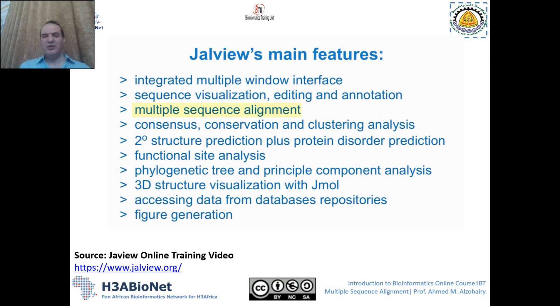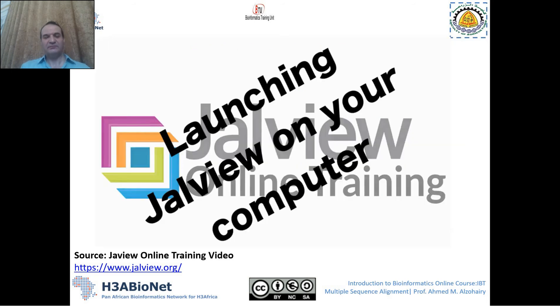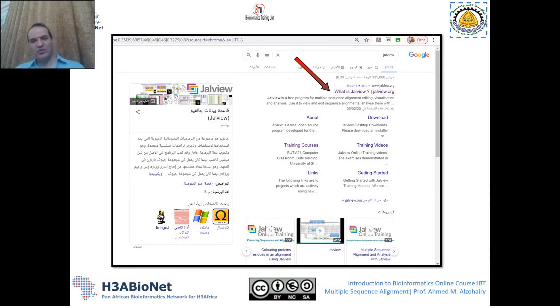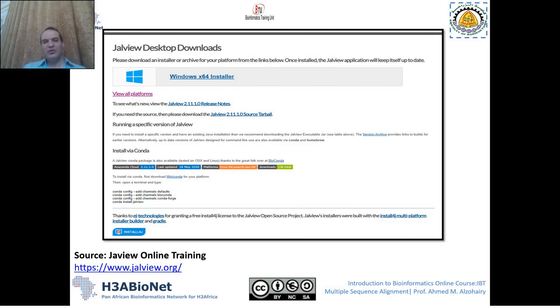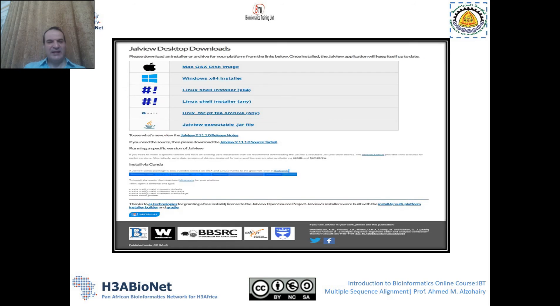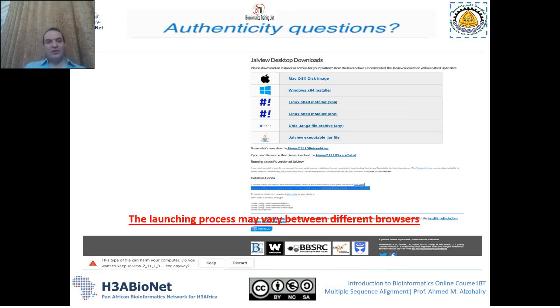To launch Jalview on your computer, go to Jalview.org and try to download the best version for your own platform. They have different versions for different platforms, so you can choose the one that suits you best. Because Jalview is based on Java, when you download it you may get an authenticity warning.